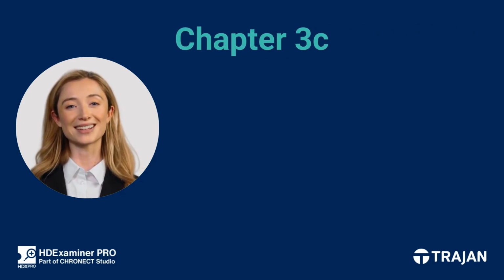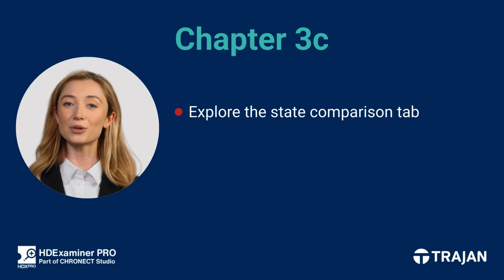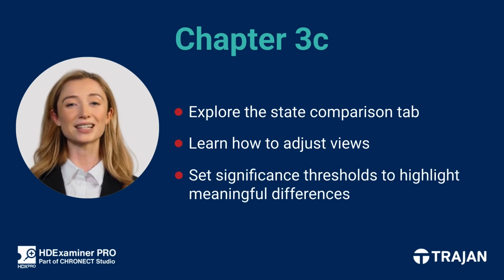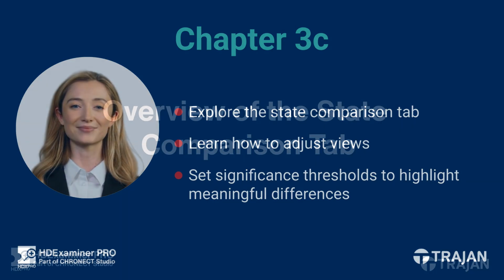Welcome to Chapter 3C. In this segment, we'll explore the State Comparison tab, your go-to tool for comparing uptake across different experimental conditions. You'll learn how to adjust views, zoom into regions of interest, and set significance thresholds to highlight meaningful differences. Let's take a look.